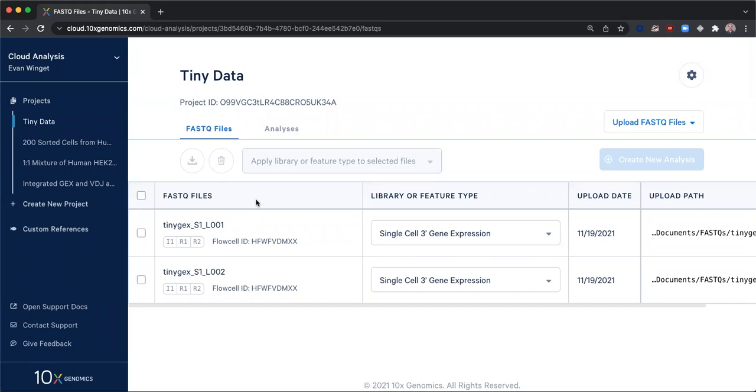Before completing these steps, I created a project and uploaded the FASTQ files for my experiment. These FASTQ files were automatically grouped into sets upon upload. Both of the FASTQ sets that I have used in this experiment contain single-cell 3' gene expression data.